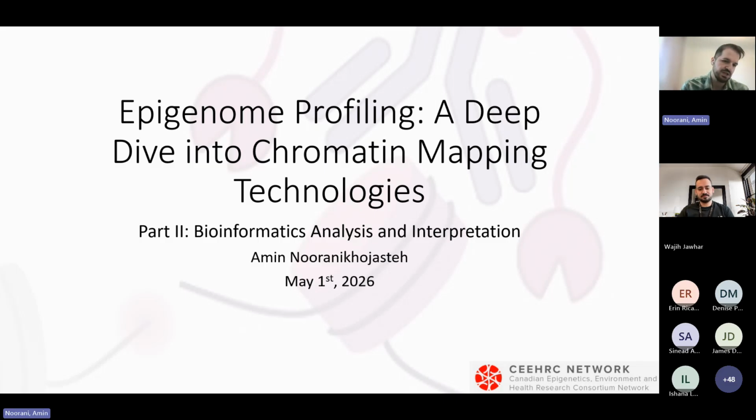And today I'm going to talk about how the data analysis works, and once you perform your experiment and you get the data, how you are going to analyze it. So let's start.